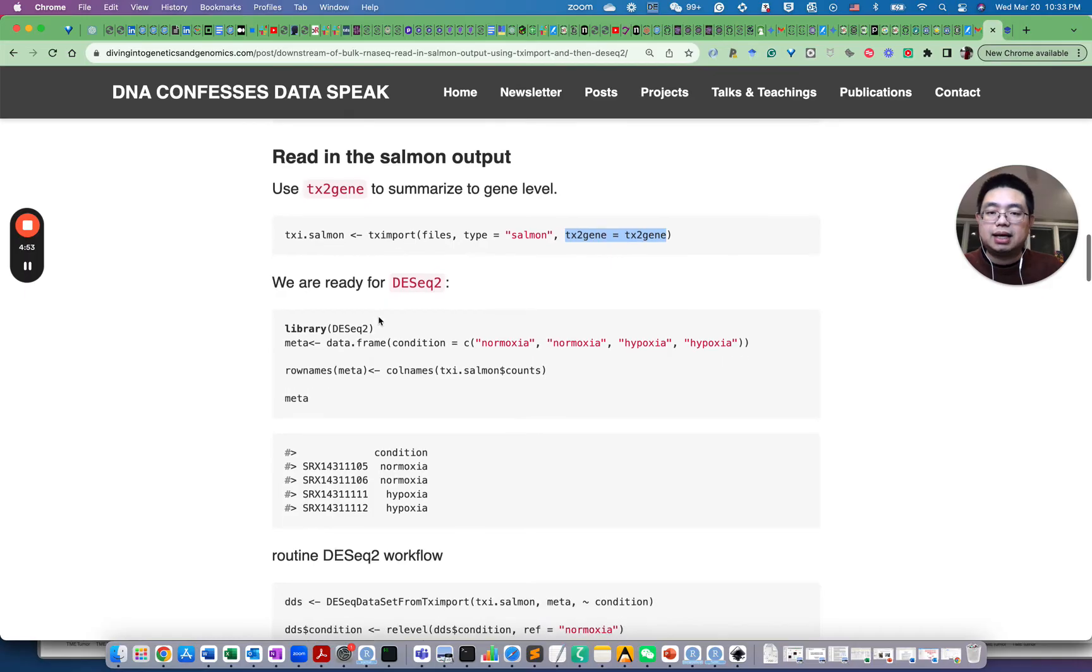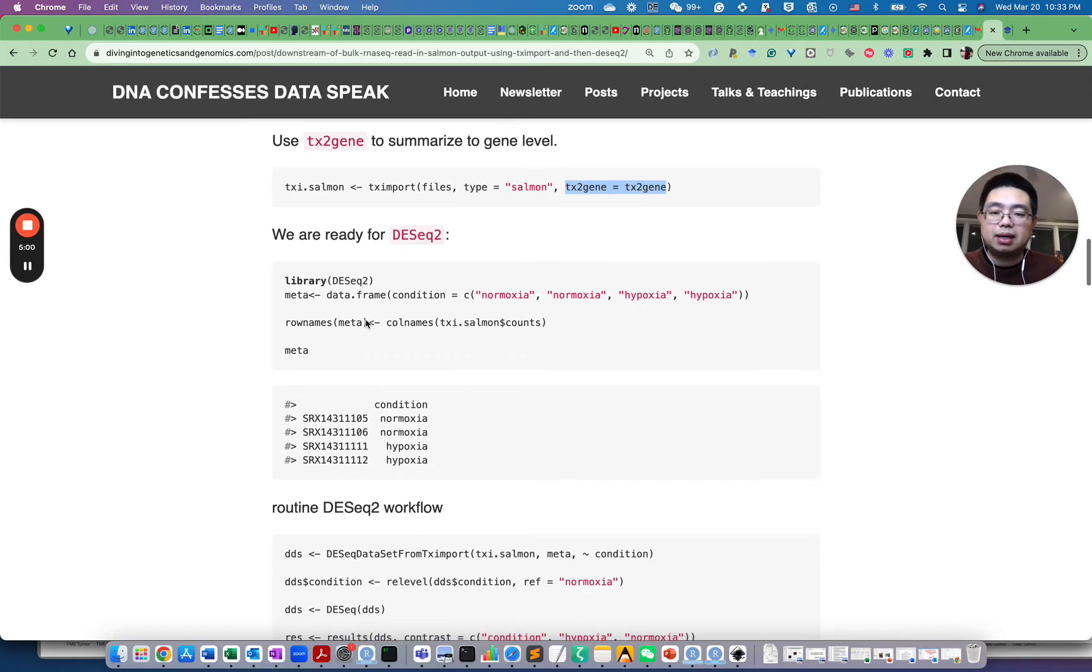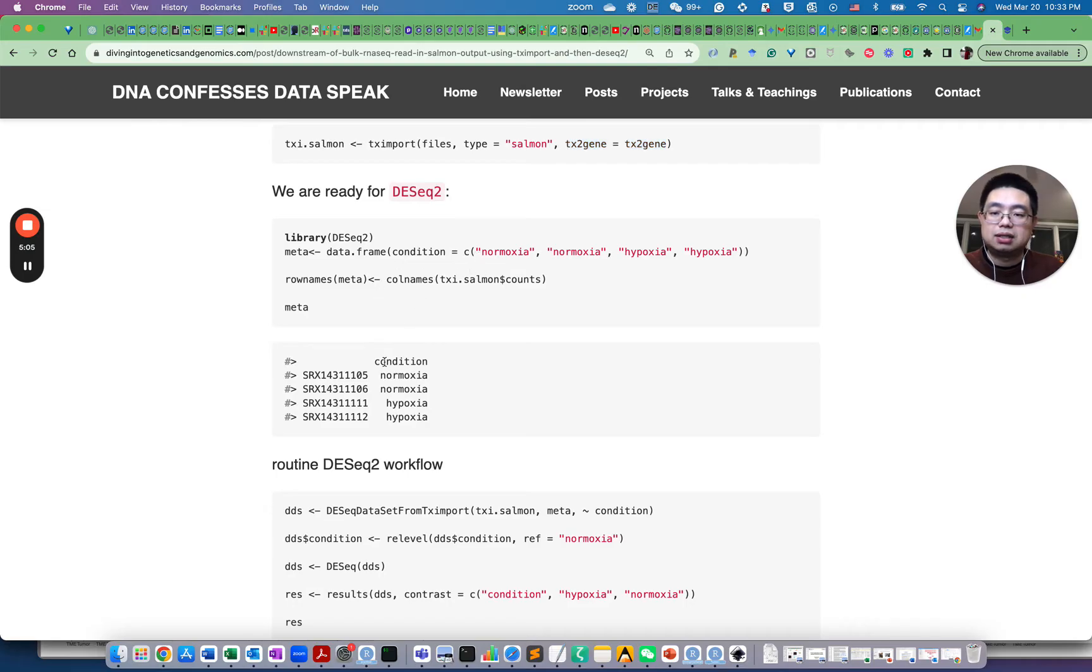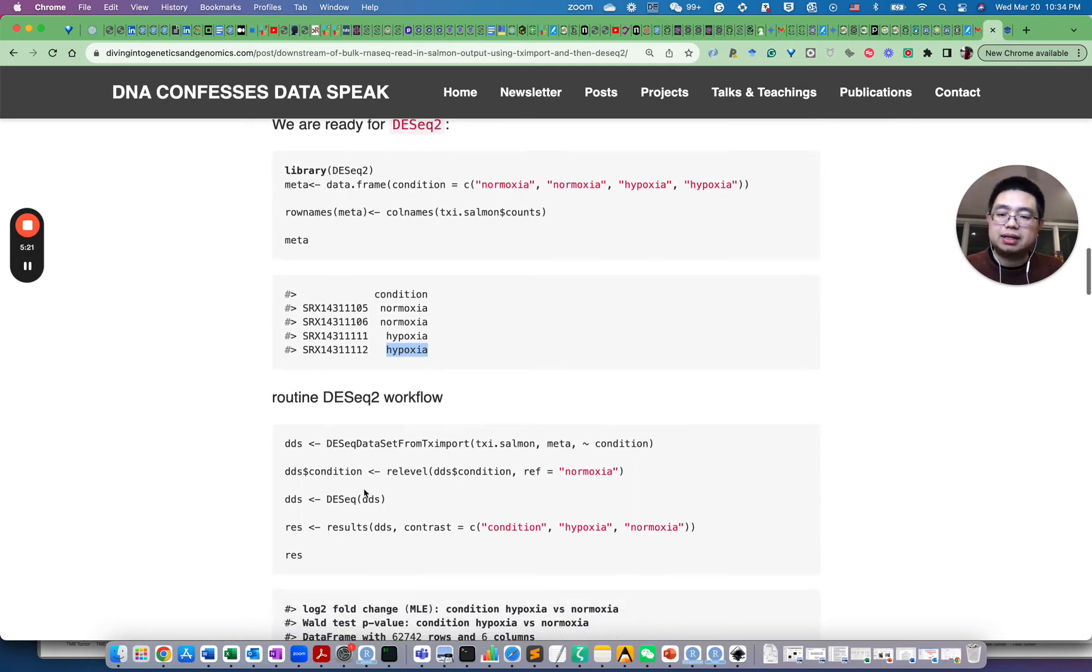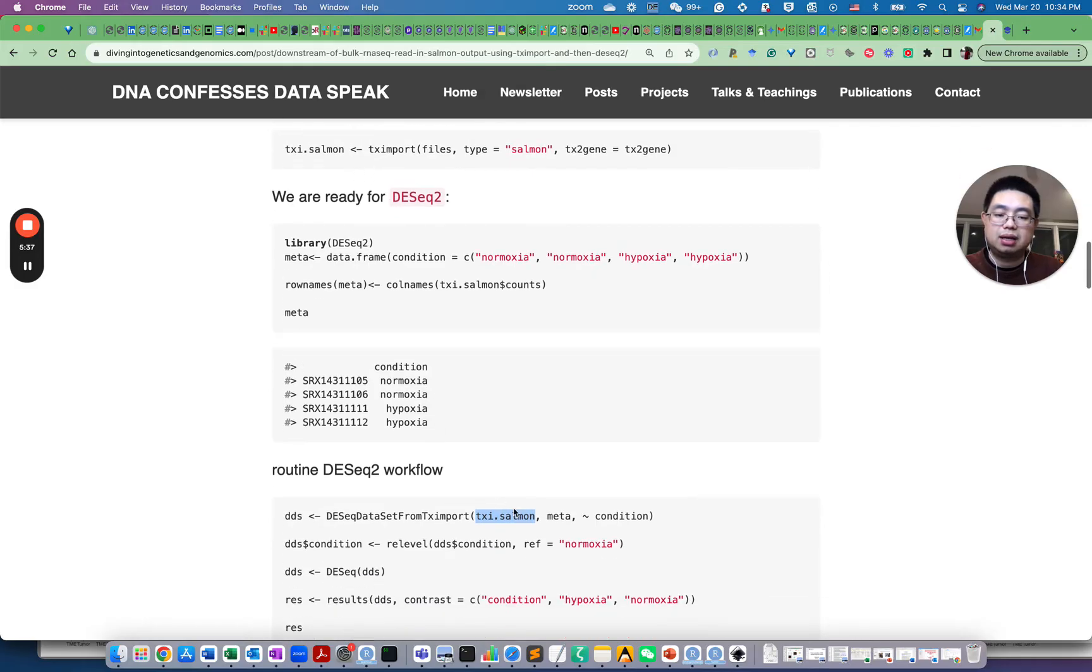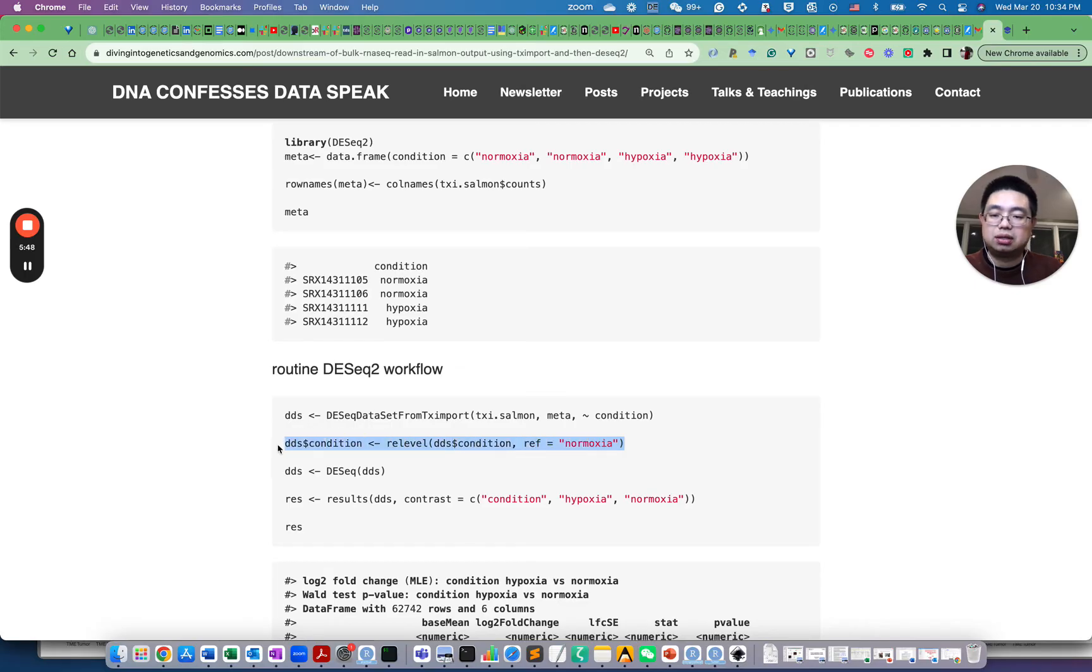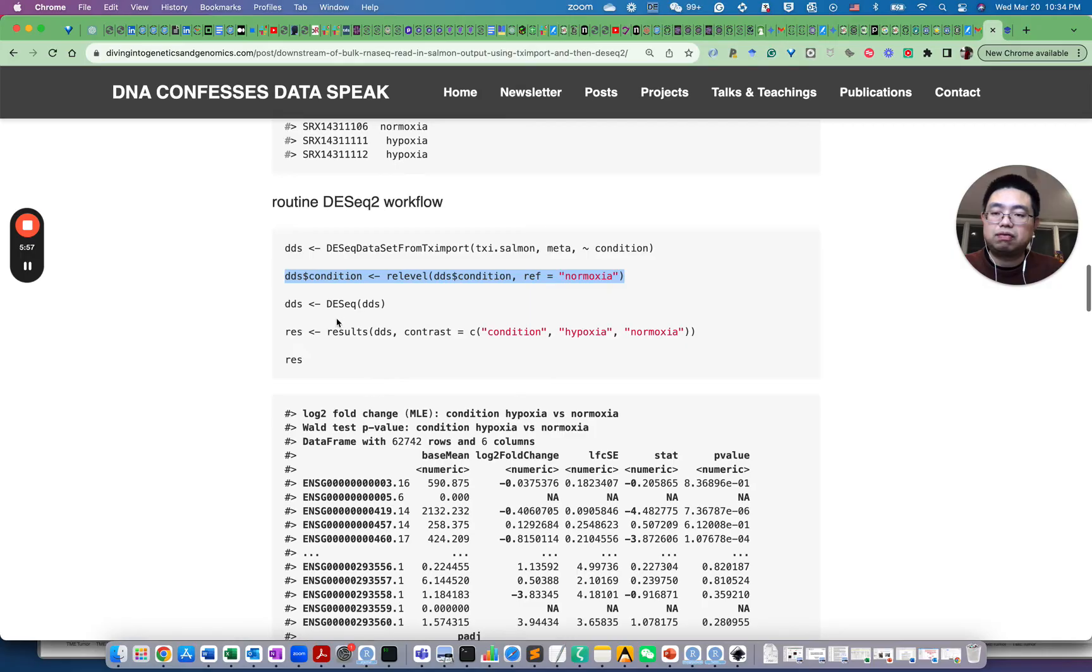And once we do this, we can load the DESeq2 library and create a metadata data frame. Essentially this data frame we're going to create with one column and those are the sample names as the row names of this data frame and first two are normoxia condition and the next two are hypoxic condition. And then we can create a DESeq2 object using DESeq data set from TX import and then we fit in the TX Salmon and this is the .sf file with the reading and provide the metadata and how you want to compare, so essentially the condition. And then we relevel that condition using normoxia as reference, so we'll compare hypoxia with normoxia.